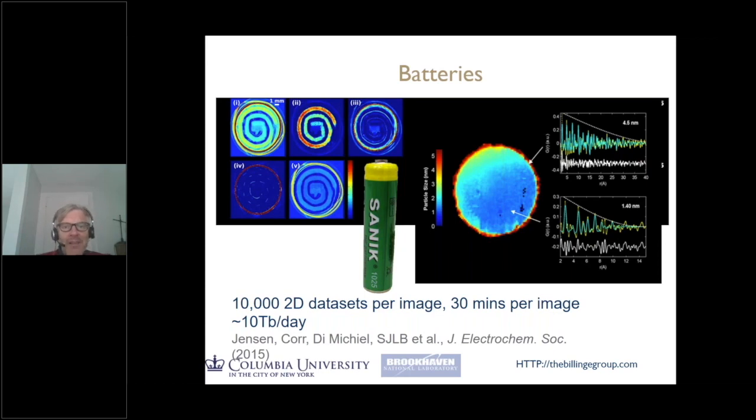What I'm going to describe, this thing on the right, is a catalyst body, which is a porous material that contains palladium nanoparticle catalysts. And what we're extracting here is a PDF of the palladium nanoparticles. The palladium nanoparticles at the surface are much larger, and the palladium nanoparticles in the center of the body are much smaller. So we can make a map of nanoparticle size as a function of position in this catalyst body.